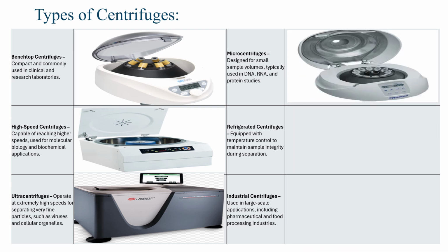Next one is the microcentrifuge. Microcentrifuges are designed for small sample volumes and are commonly used in DNA, RNA and protein studies. They provide rapid and efficient centrifugation for molecular biology and biochemical applications, right?